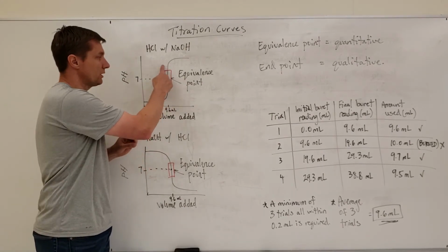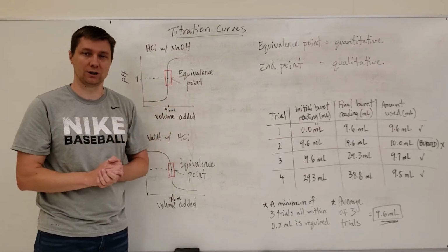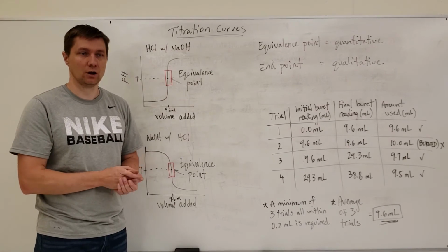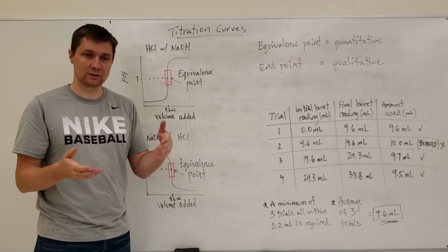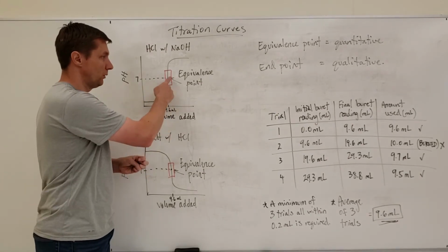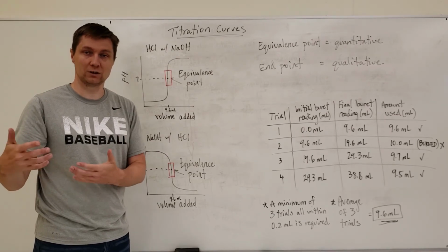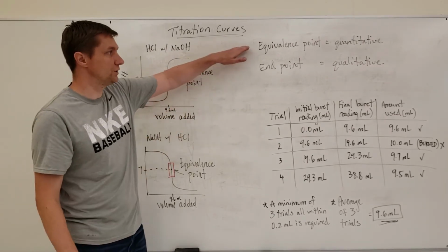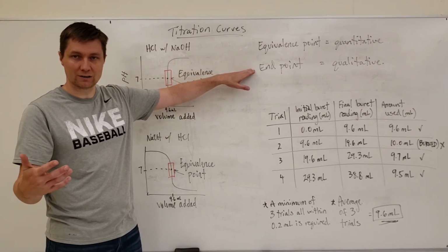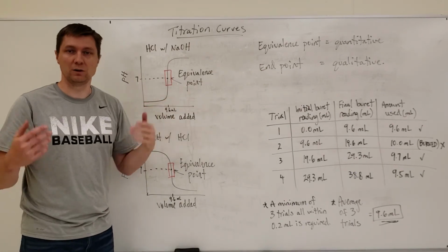Now, this red box here is what indicates what would be a good range of a pH indicator to use for this particular reaction. You would want to pick an indicator that has a pH range that sits around the equivalence point, because there's no way that you're going to be able to know when you're physically doing the titration that you've reached the equivalence point if your end point, the color change that the acid-base indicator turns, is down here at say pH 2.